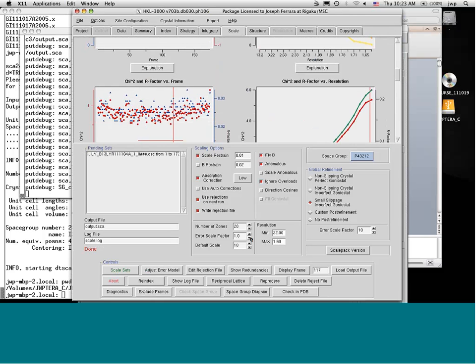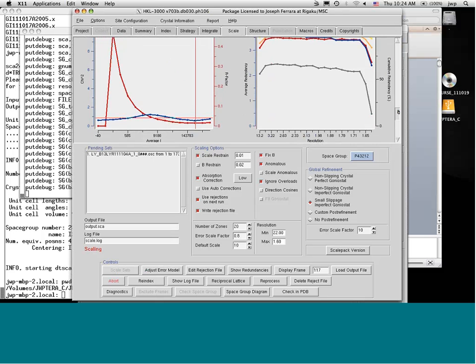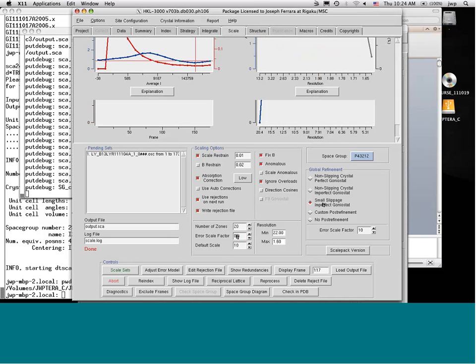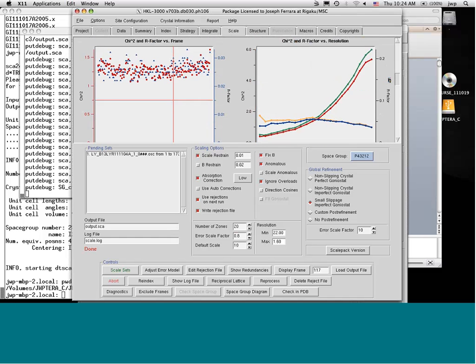So what can I do here? 1 is too high, and I think, well, maybe I did it wrong. Did I go the wrong way? Let's try 0.8. The interface is quick enough and the program is quick enough that you can do a lot of stuff by trial and error. So basically, I just made a hypothesis that if I make this 0.8, this will be closer to 1. So I went the wrong way, and I will change this to 0.95 and run it again.